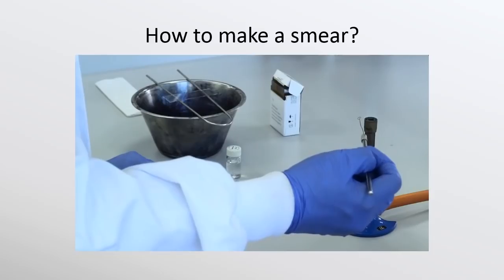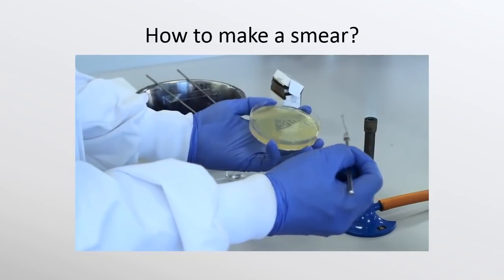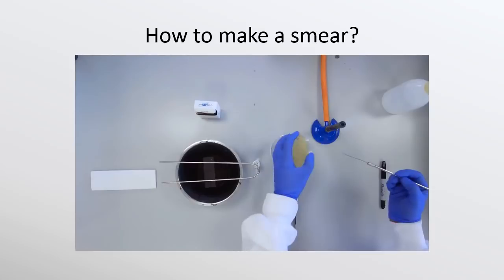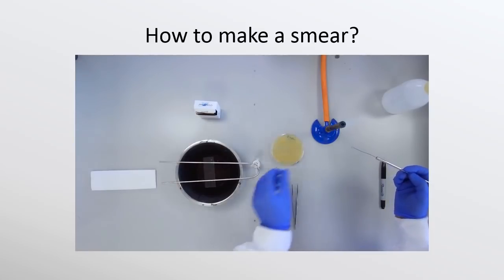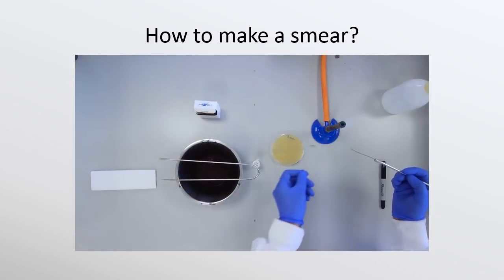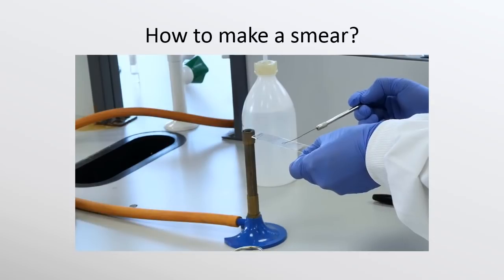Aseptically take a small quantity of a colony from an agar plate on which the culture of interest is growing. Transfer this culture to the water drop on the slide and spread as shown here until the colony and water form an emulsion.